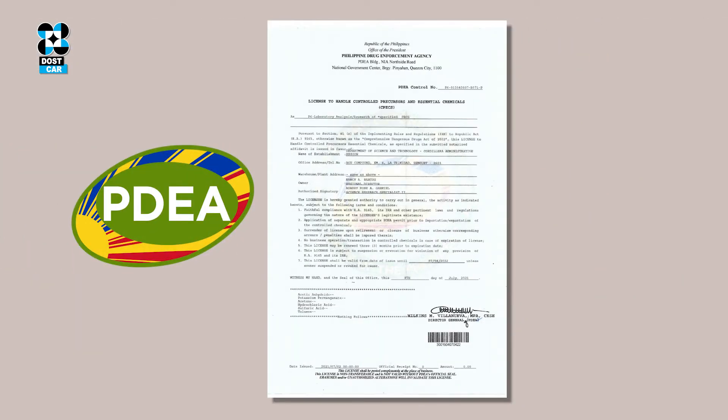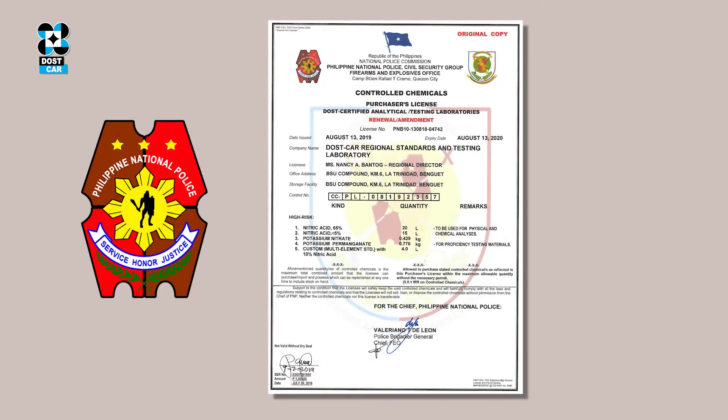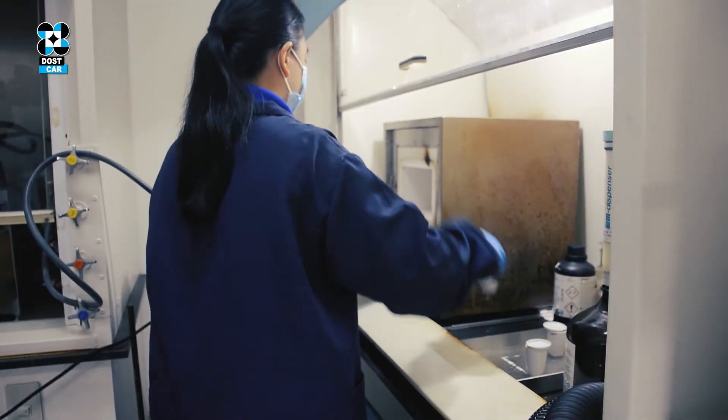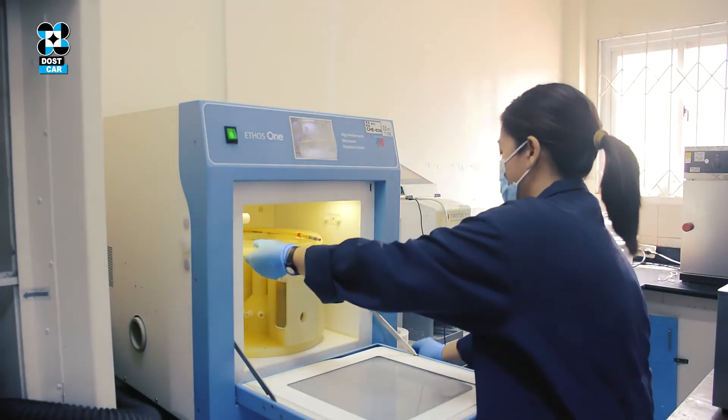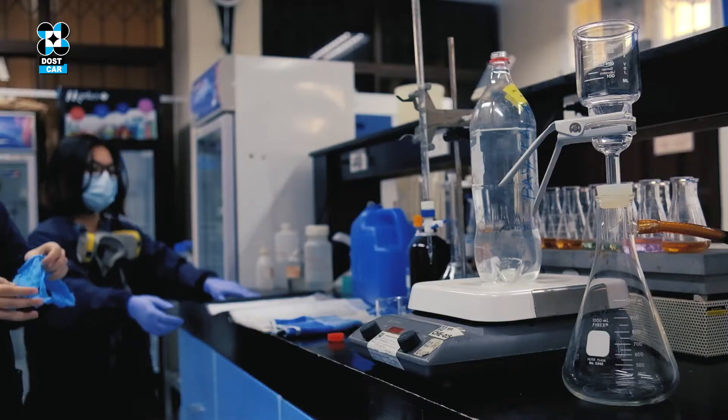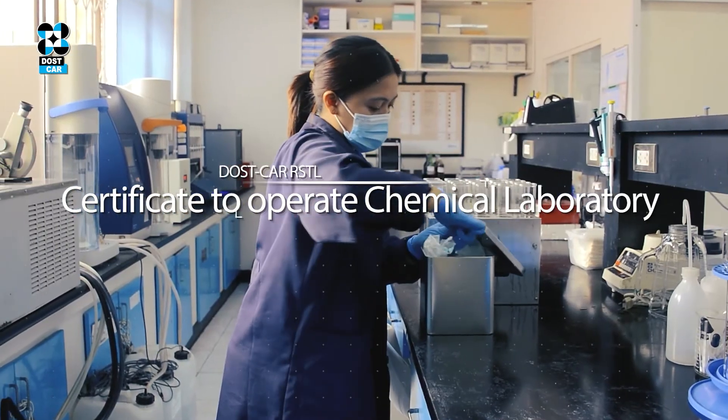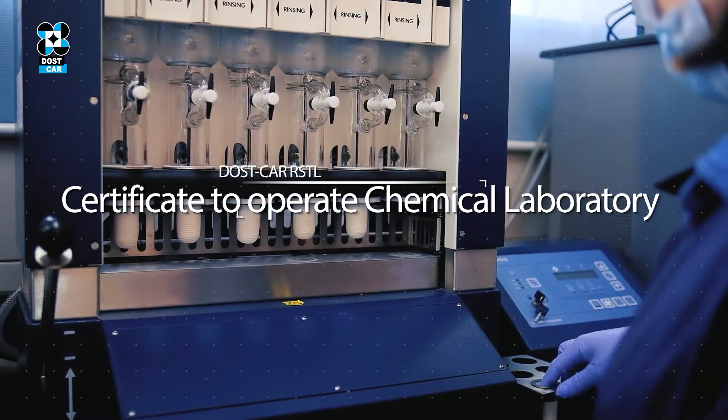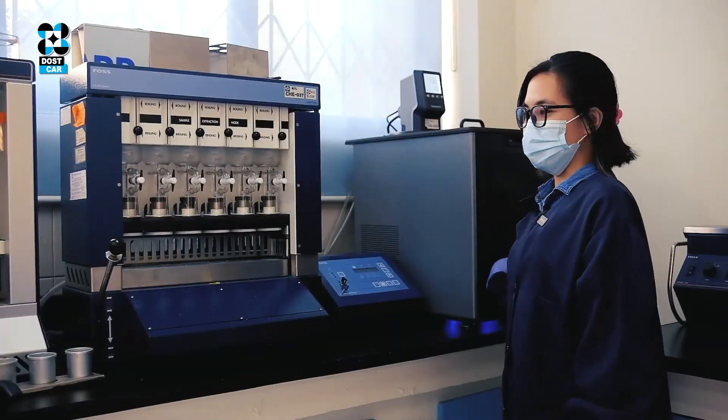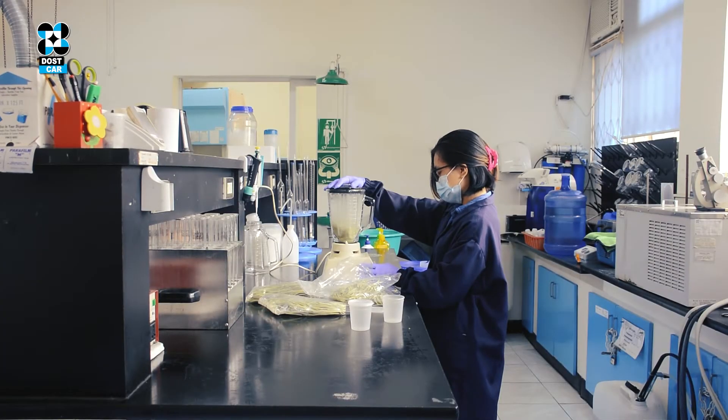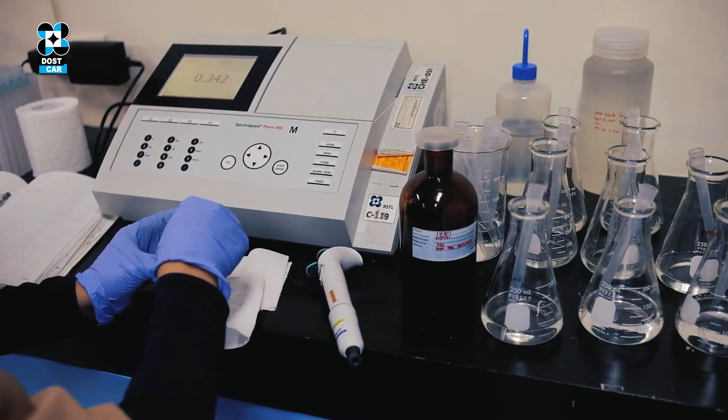Regulatory requirements from the Philippine Drug Enforcement Agency and the Philippine National Police are also strictly being followed by the RSTL. Further, the Chemical Laboratory holds a Certificate to Operate Chemical Laboratory for its compliance to RA 10657 or the Chemistry Law of the Philippines.